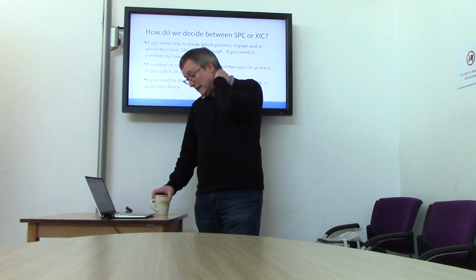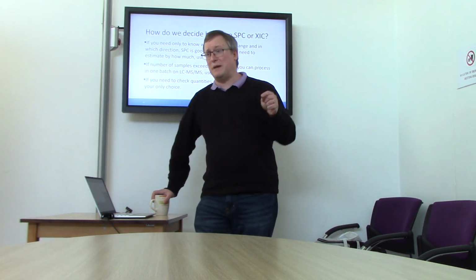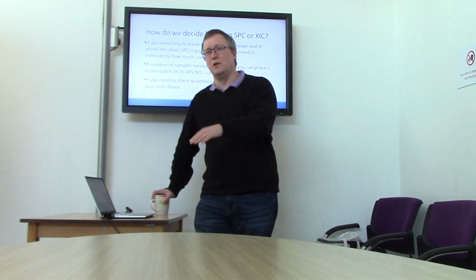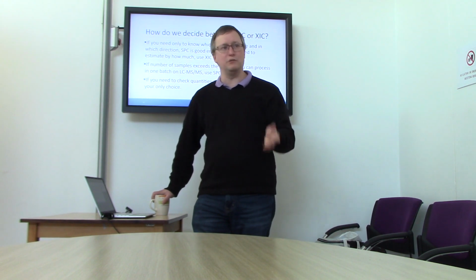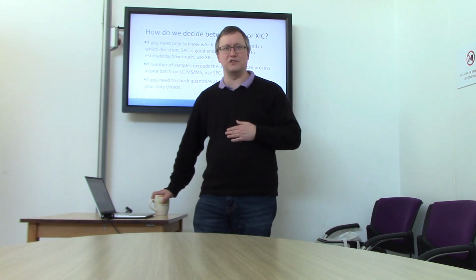Okay, finally, if what you're trying to evaluate is the quantity of particular peptides, for example, to ask what fraction of these peptides carry phosphorylation as opposed to being nude of phosphorylation, then doing something like that via spectral counting is a non-starter. You really would need to use XIC-based analysis to work your way through questions like that.